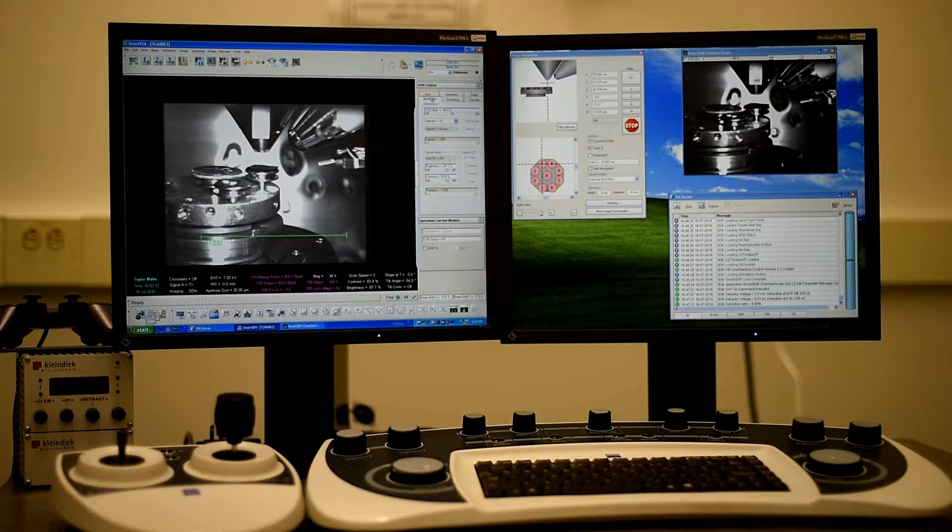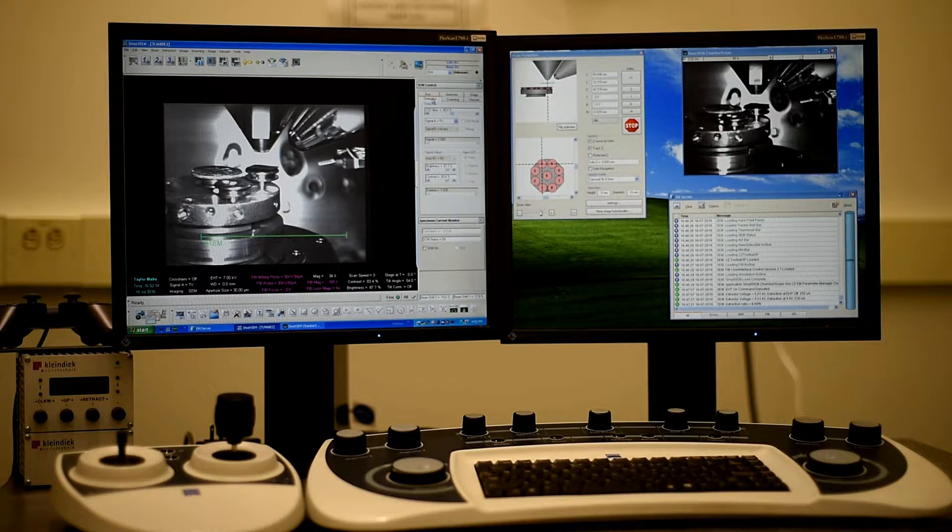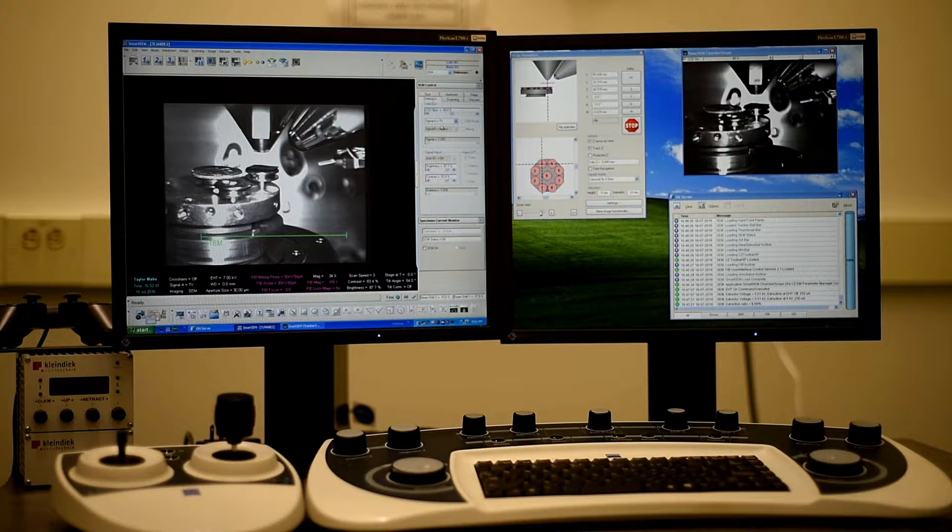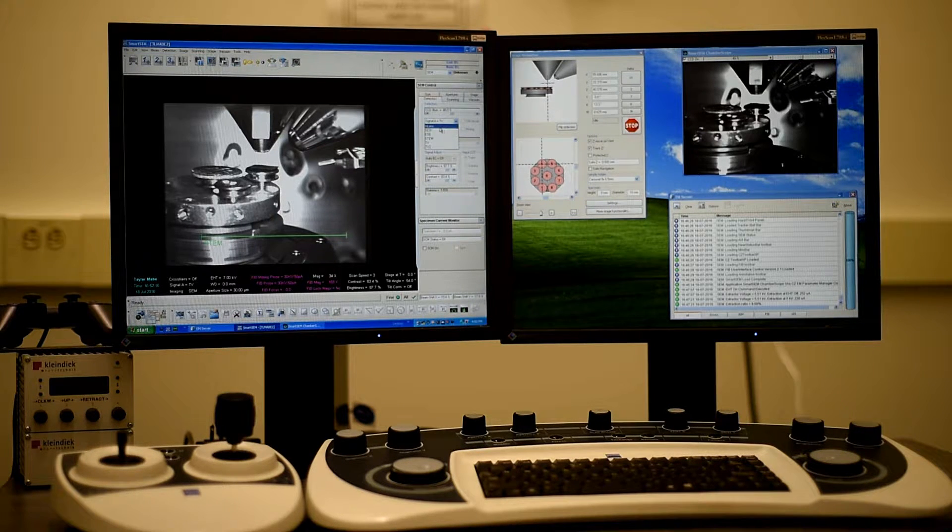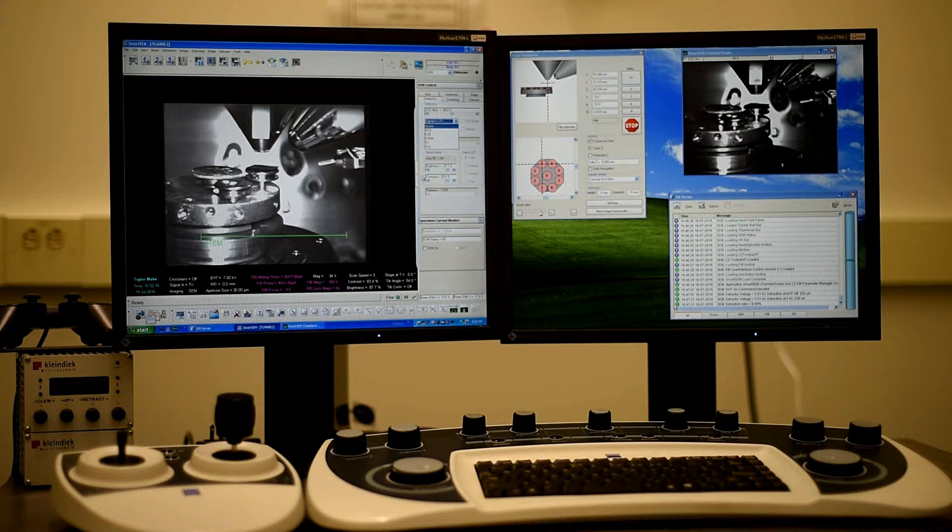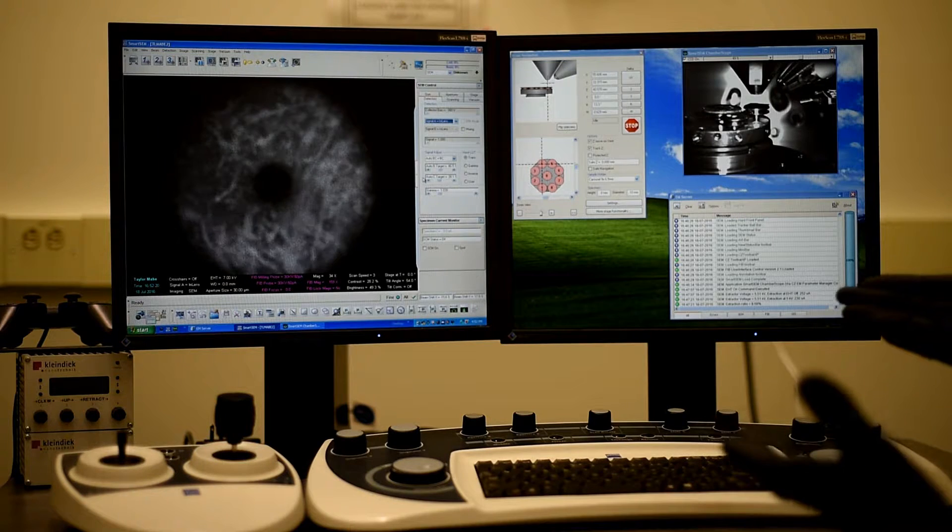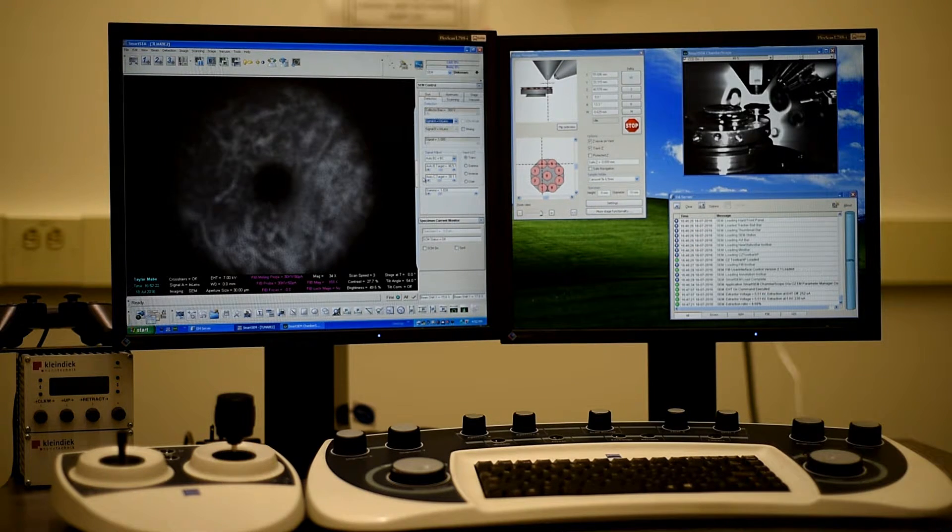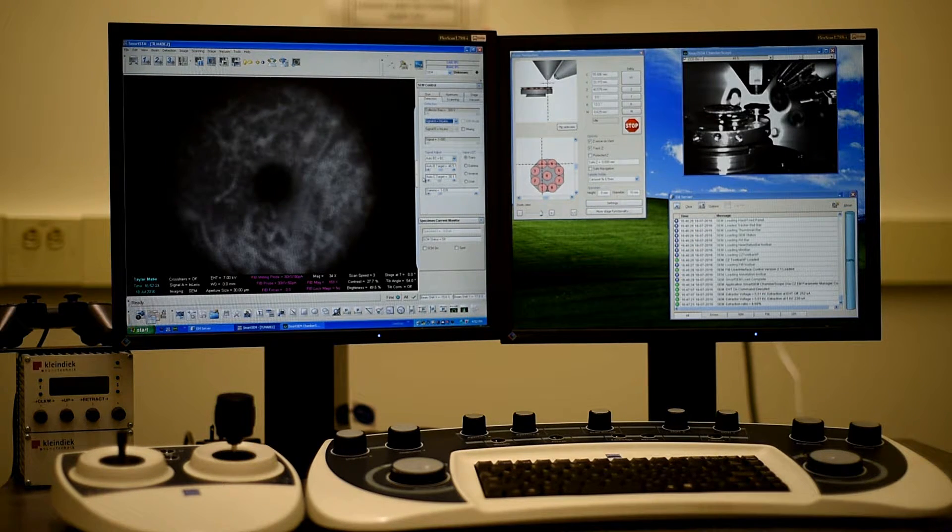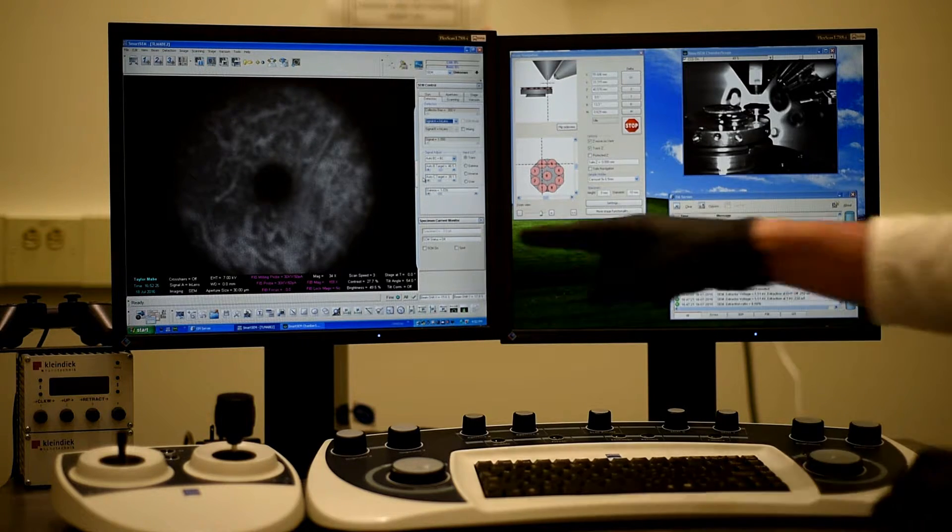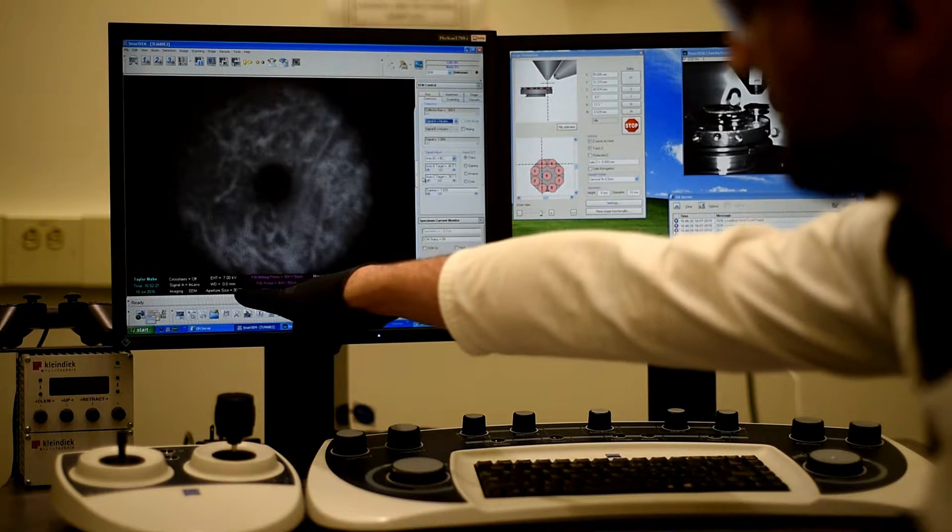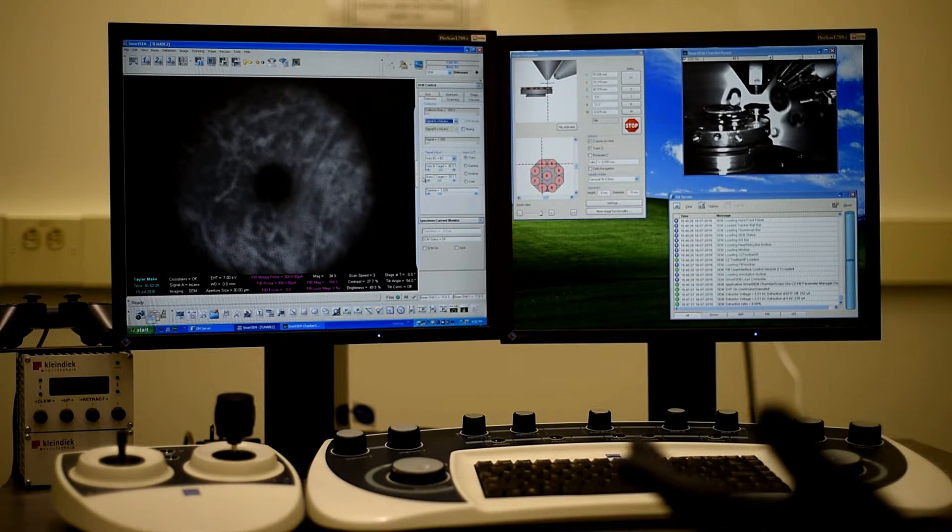So what we can do is go to detectors, the detector tab, and then switch from TV. We'll go to in-lens. Now we're actually looking down to our sample. And the working distance is typically given in the bottom data zone. Right now, it reads zero.